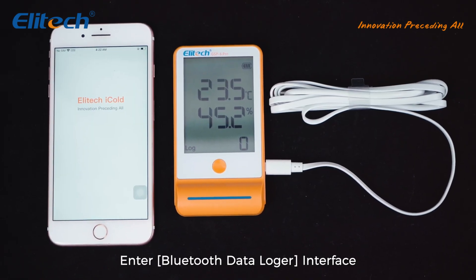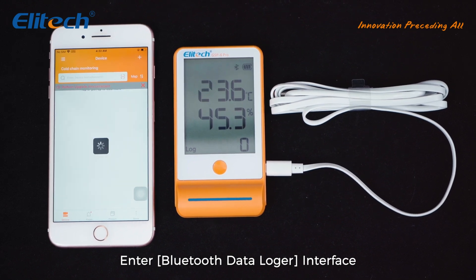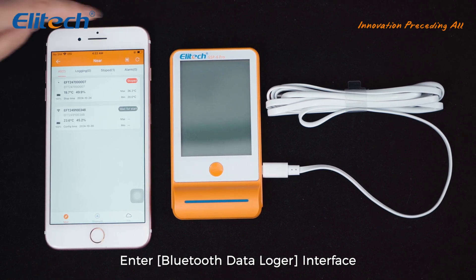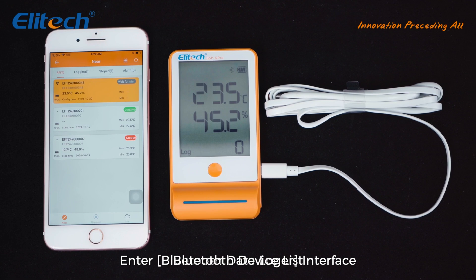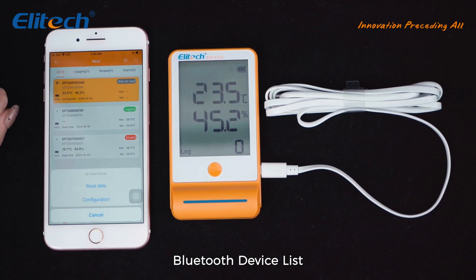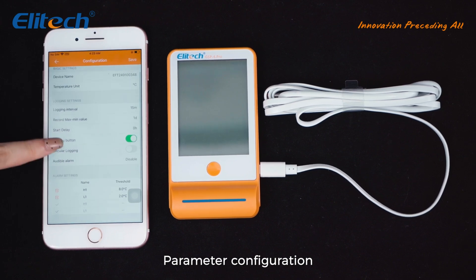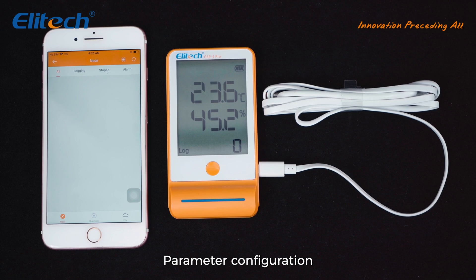Click the menu button in the upper left corner to enter the Bluetooth Data Logger interface. The app will automatically detect nearby Bluetooth devices. Click the main button of the device and it will pop up to the first place in the list and be highlighted. To configure your local time into the logger, it is necessary to configure parameters before first use.